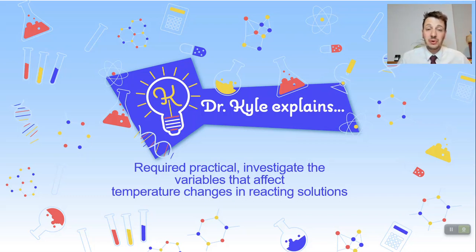Today we're going to be going through the required practical where we investigate the variables that affect the temperature changes in reacting solutions. Now this is for trilogy and triple, higher and foundation.